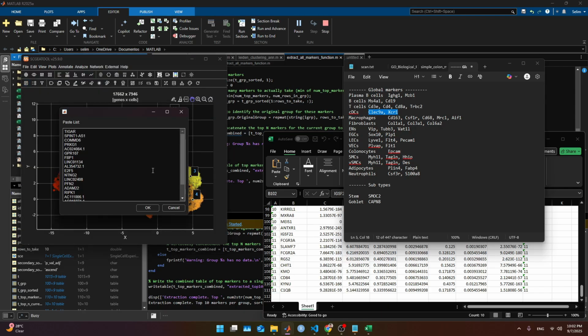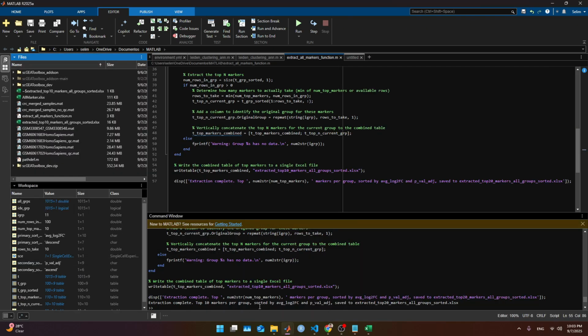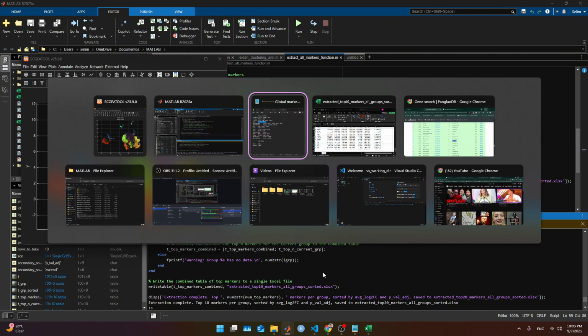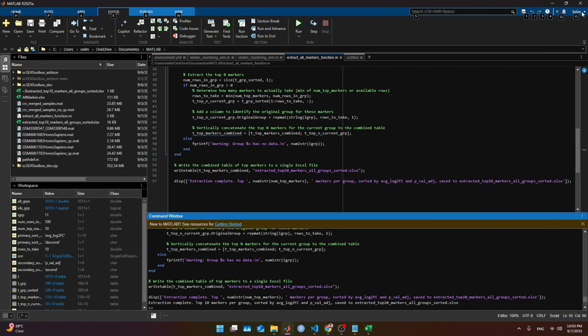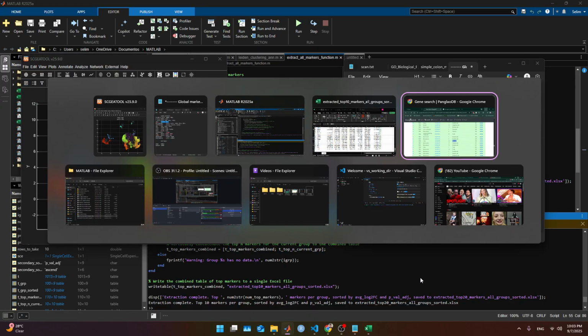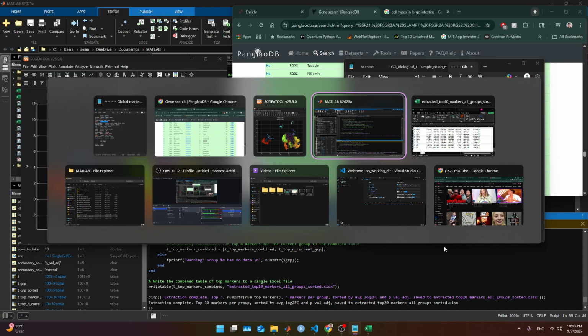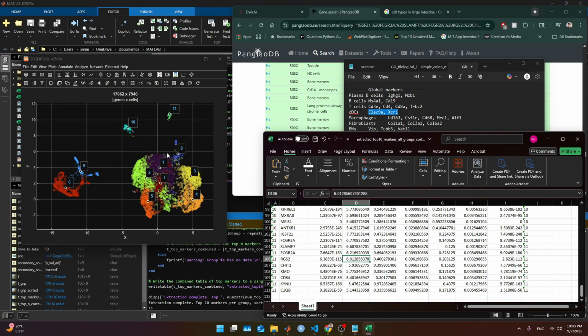It didn't work. Let's do it again. All right. All this is complicated, I know. We'll look now at cluster 10.